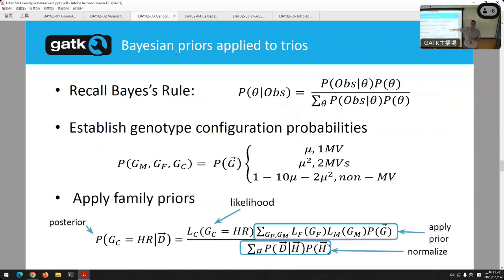If you're assuming there are about 20 de novo mutations per genome, then you can just put that into the mathematics. You also have to account for the fact that, let's say, both parents are homozygous reference and the child is homozygous variant. Is it possible? It's possible. Is it likely? No. The probability is the chance of a Mendelian violation squared, the same violation in both haplotypes. But it's possible, so we have to account for it in the math. That's all accounted for, and that's what we've done here.